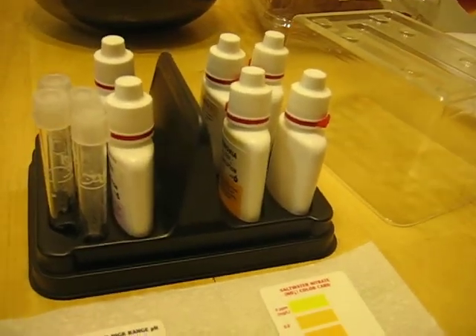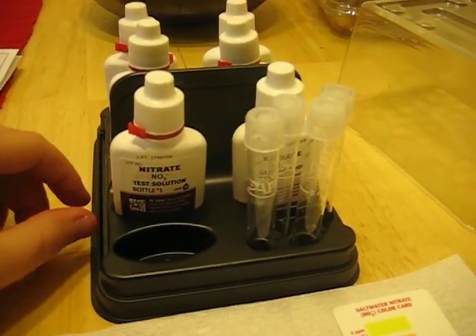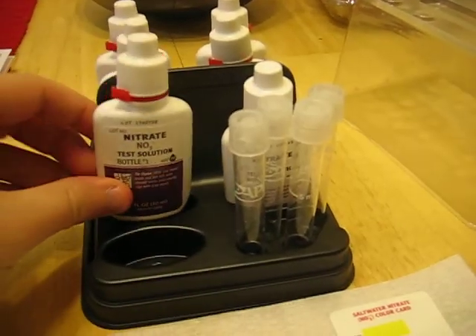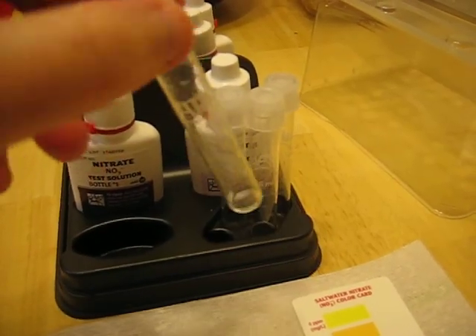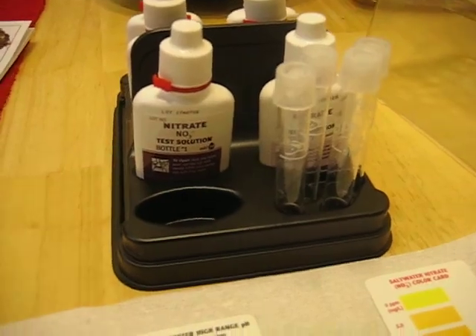This is a video of the API Saltwater Master Test Kit. What you get in the box is a nitrate, nitrite, pH, and ammonia drops — the bottles all look like this, just labeled. You also get four little test tubes, as well as some cards to show you. You basically just match the color of the test to the card, and the cards also have instructions on the back in little picture form.